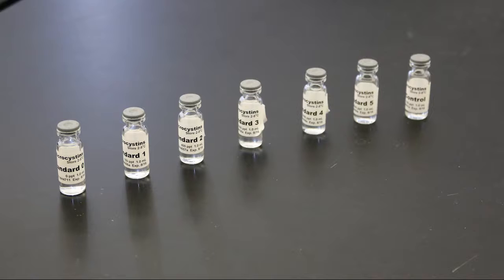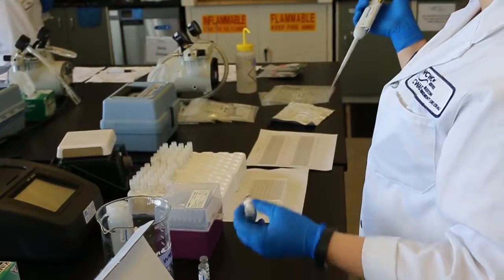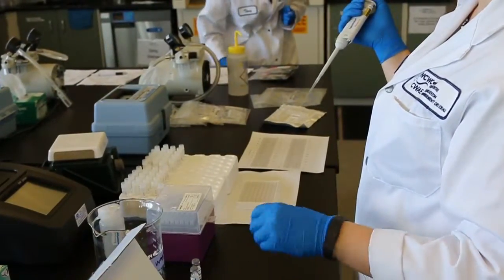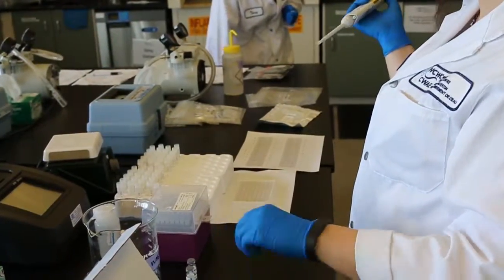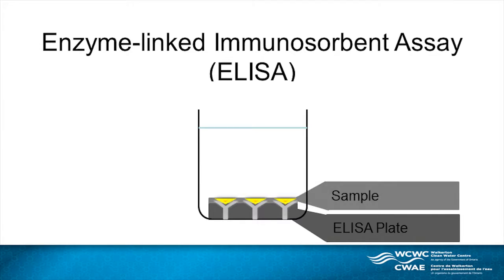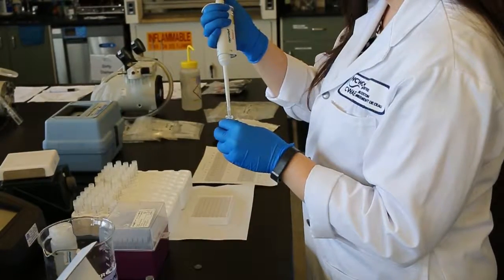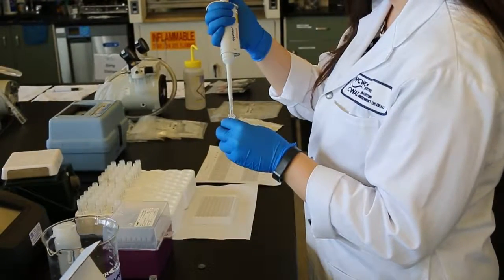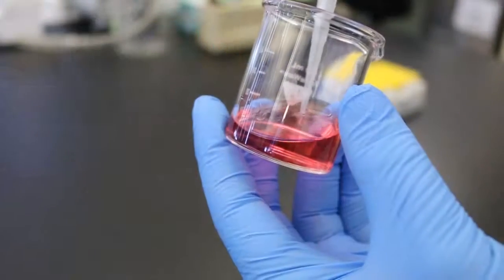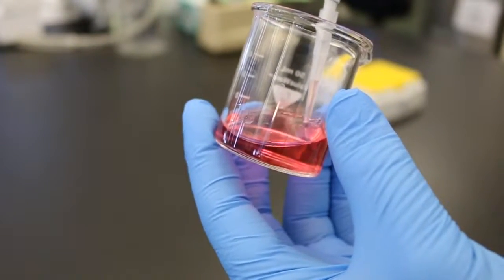50 microliters of each standard solution, control, and sample are pipetted into the wells of a test plate using a new pipette tip for each sample. It is recommended to pipette each sample in duplicate or triplicate to ensure accurate results. All pipette tips should be conditioned as best practice.